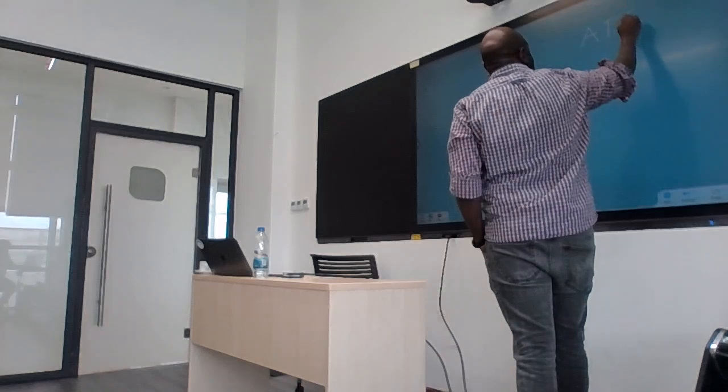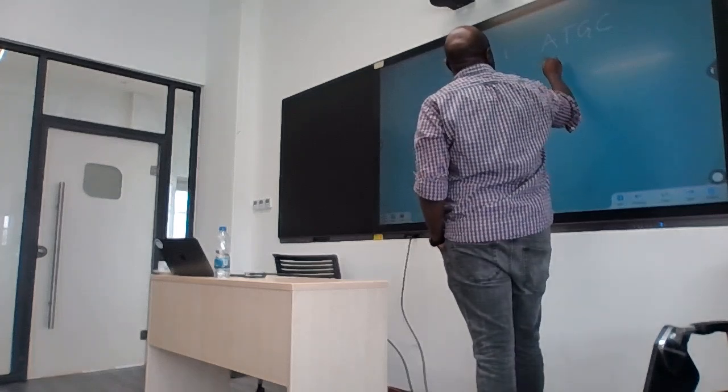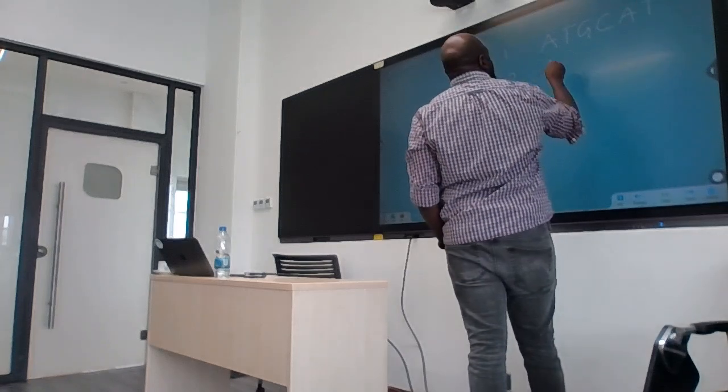I'm just going to name them ATGC, Sample 1. Sample 2 we have AT.